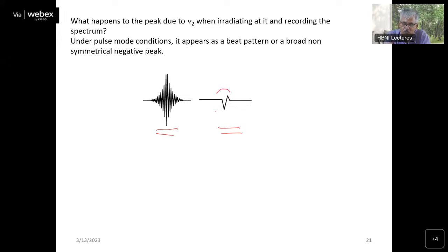Okay, so this is the way that we have irradiated at this position, or at this position. Sometimes you will see this beat pattern, mostly when the frequency is not exactly matching. There could be a very little bit of difference, because when you are considering a multiplet, it will be difficult to select exactly the frequency position. But anyway, it does not matter. It gives you the result. Whether in the spectra you see these or these, you know where you have done the irradiation.